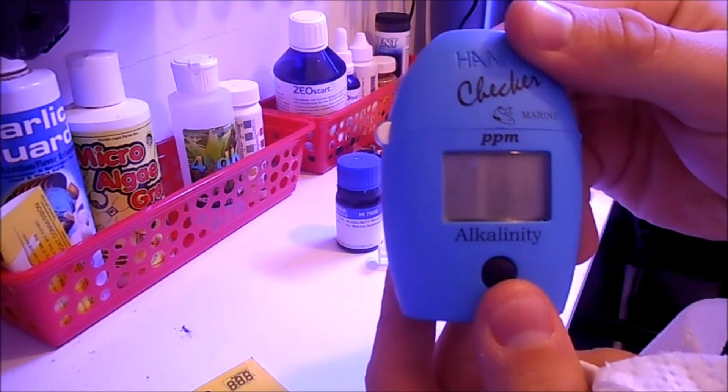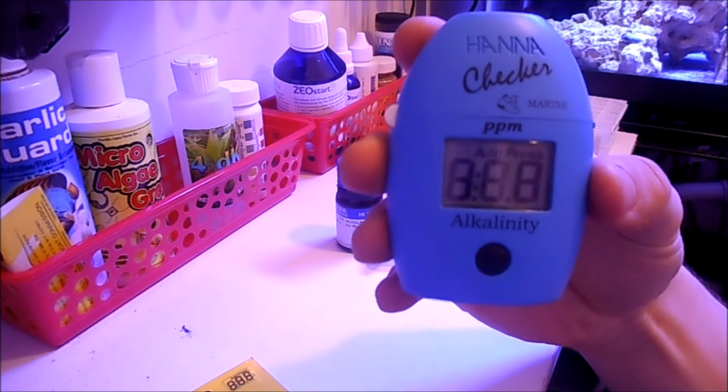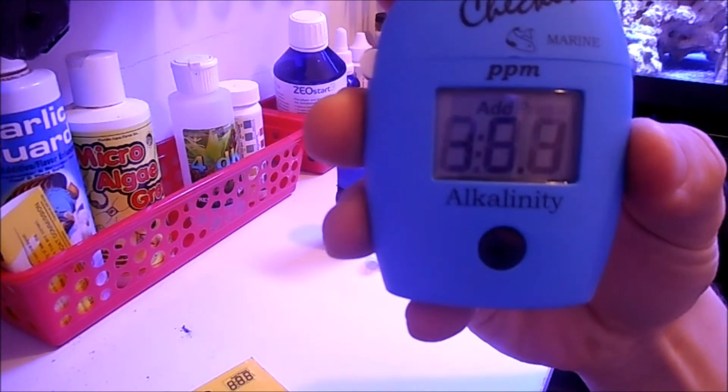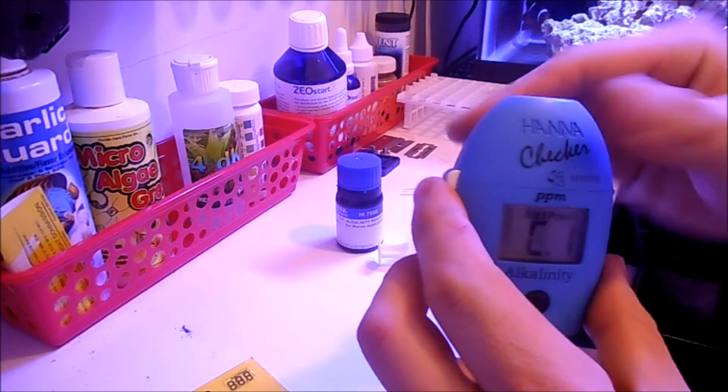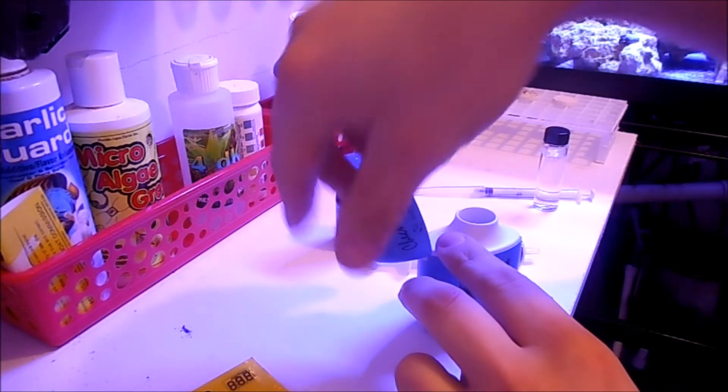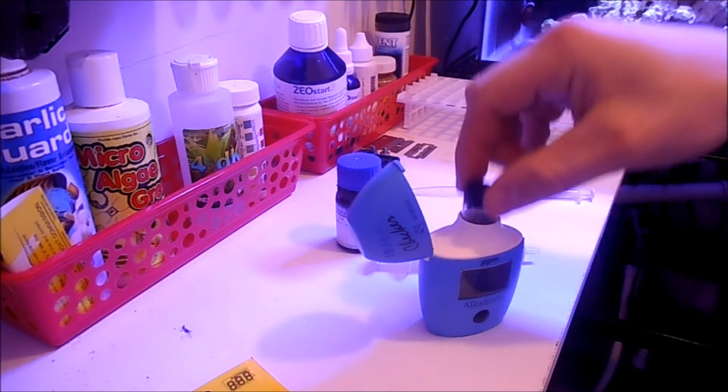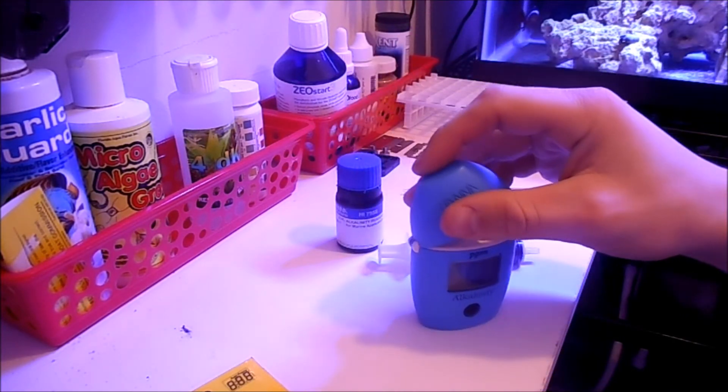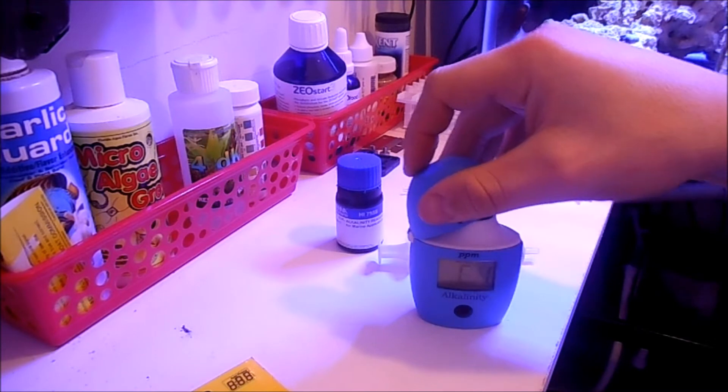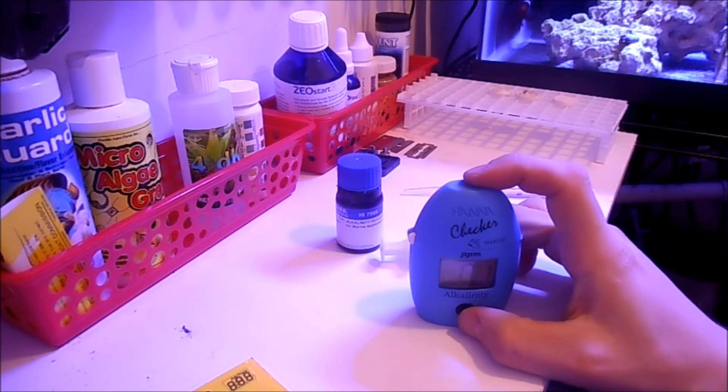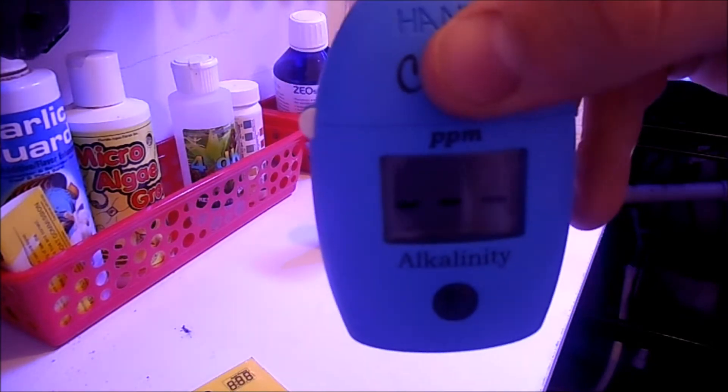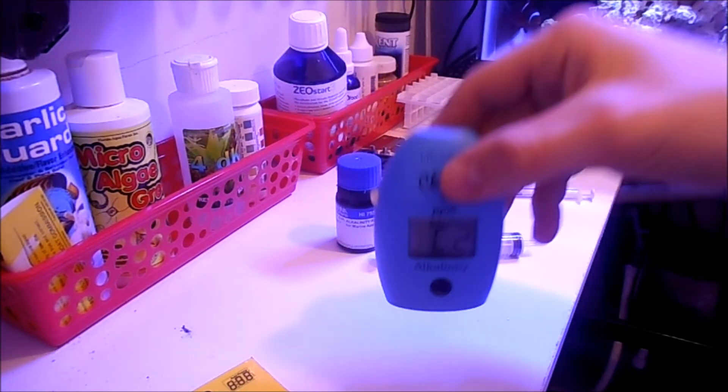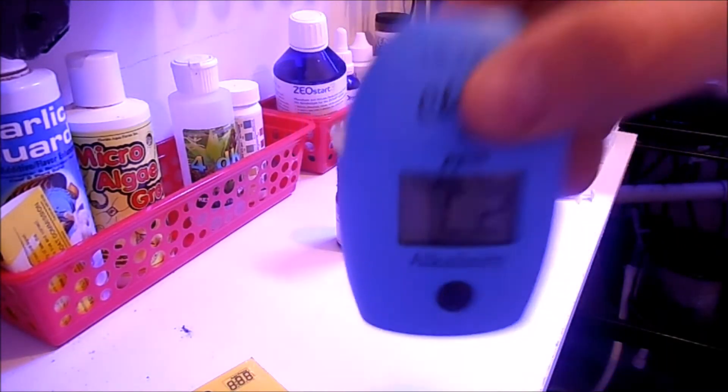Set that aside. You're going to turn on the Hannah checker itself. Now add C1, so basically you add the empty container with just the water, no reagent. Then you hit the button once and wait for it to do its thing. Basically it's zeroing it. Okay, now it says 2.